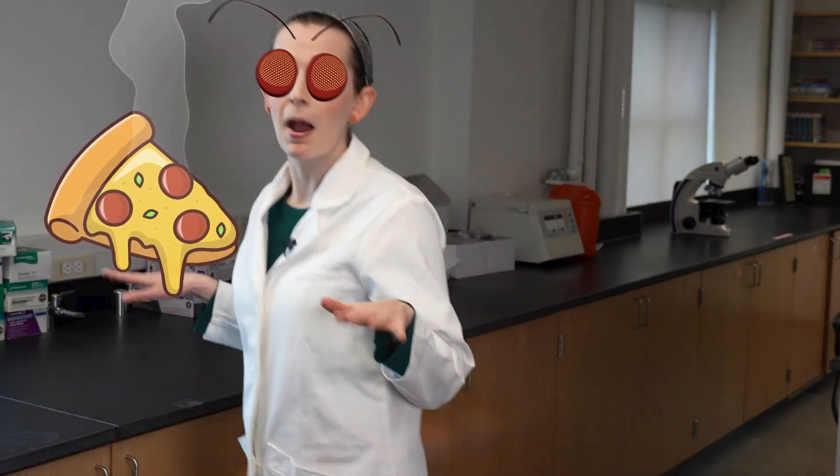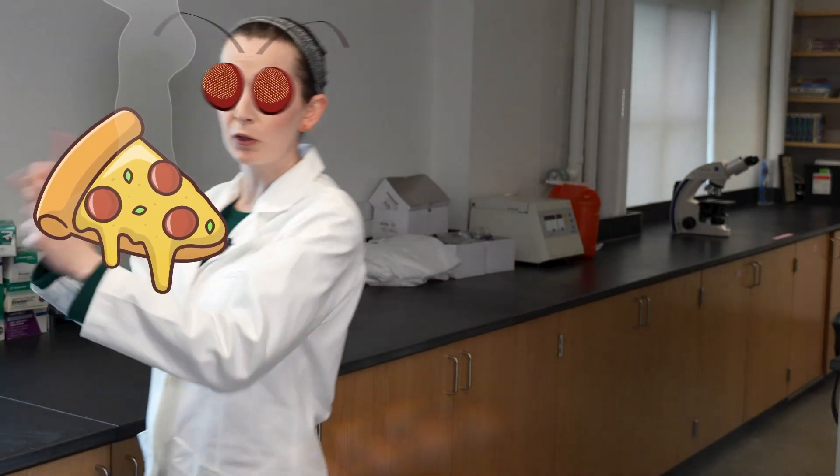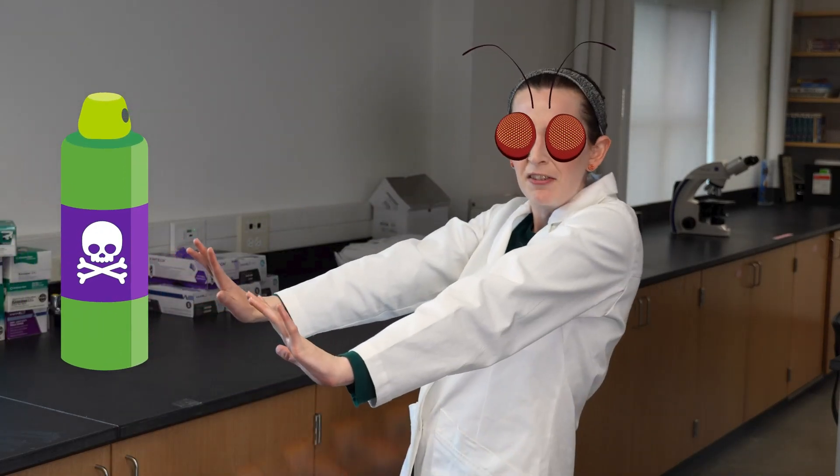Imagine that I'm a fruit fly. A lot of my daily routine is based on instinctively reacting to stimuli in my environment. If I smell something yummy that could be food, I'll exhibit positive chemotaxis — movement toward a chemical stimulus. If I smell something nasty that could be bad for me, I'll exhibit negative chemotaxis — movement away from a chemical stimulus. I totally rely on these behaviors to survive and thrive in the world.